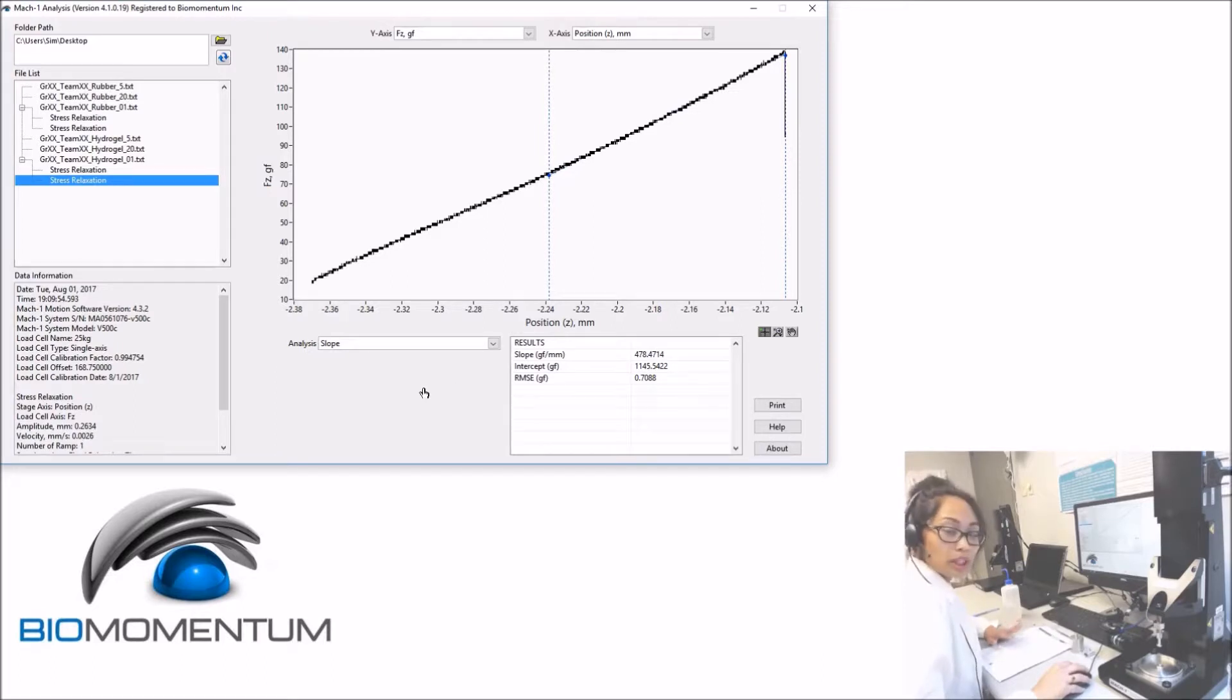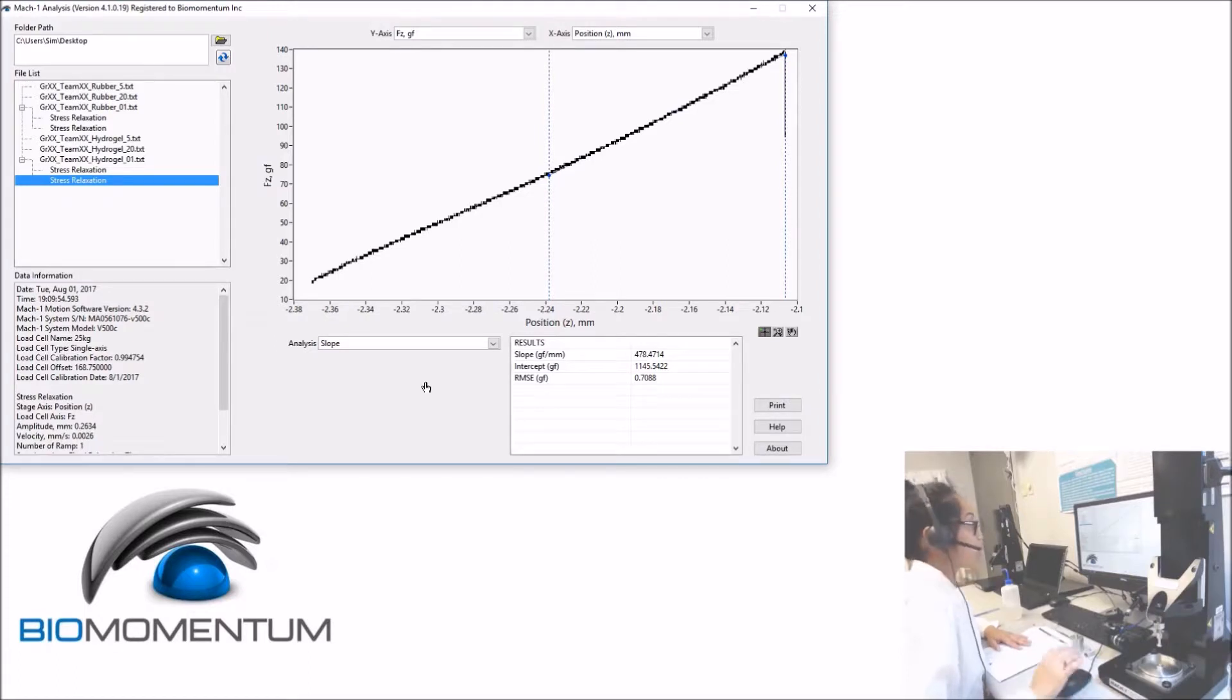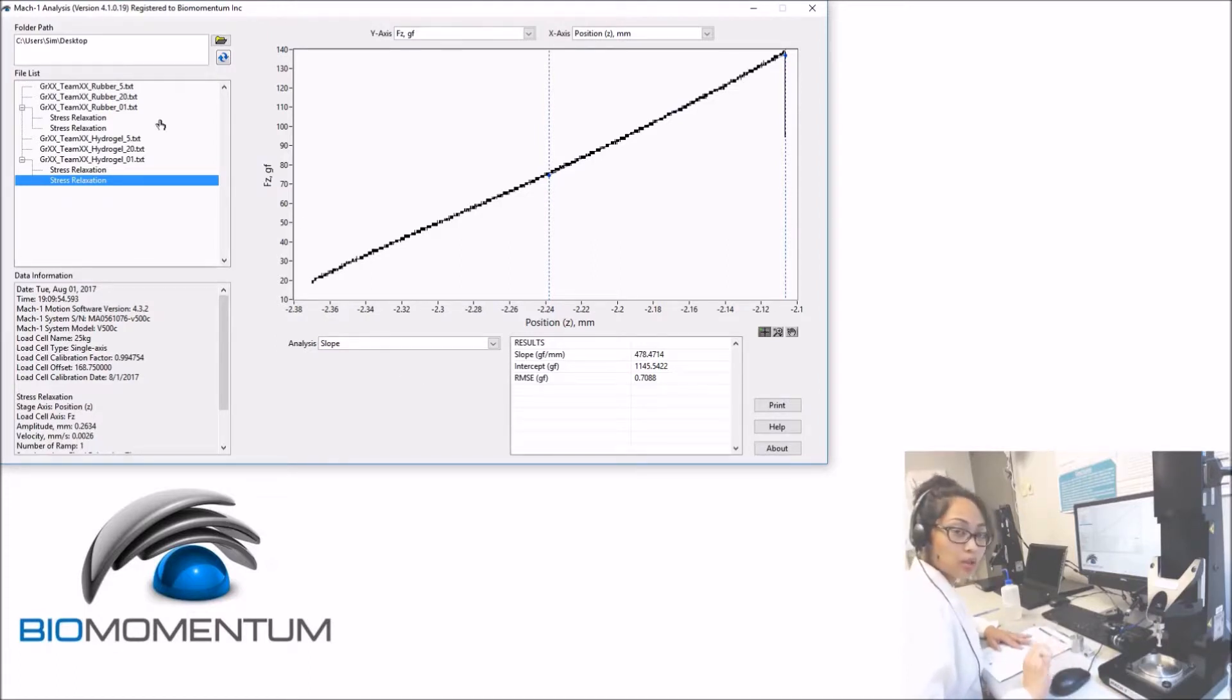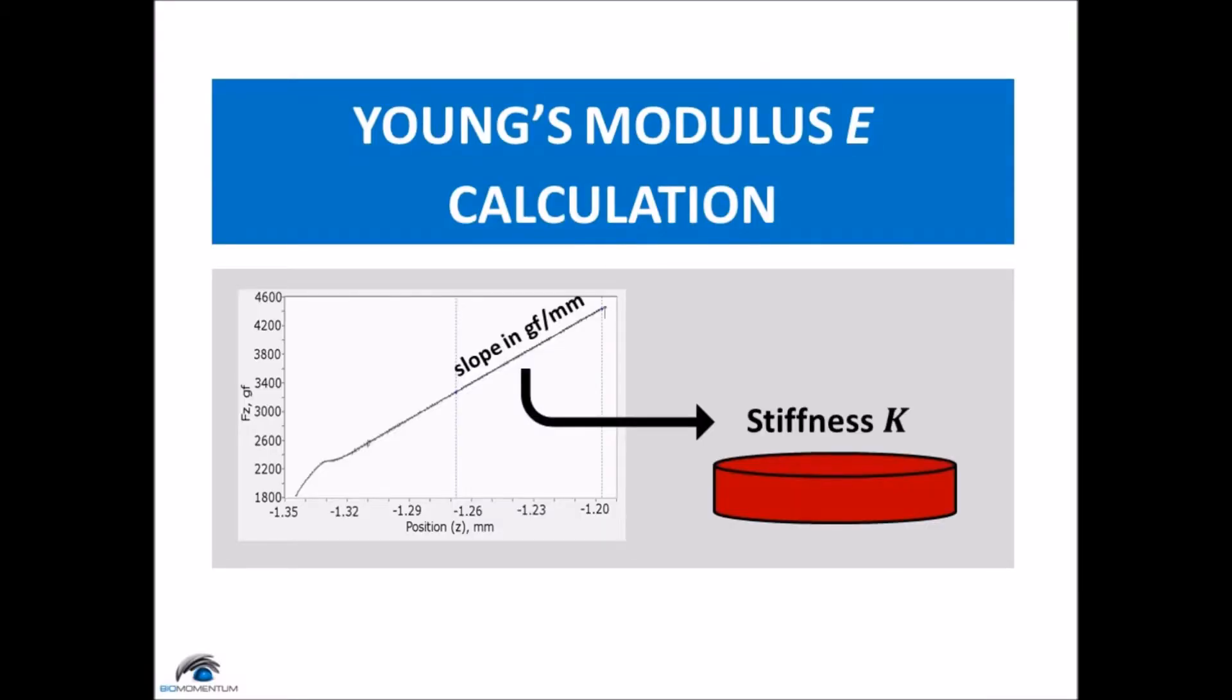Repeat those steps for the two remaining rubber disks and the two remaining hydrogel disks at different strain rates, which are 5% and 20%. The slope obtained from the analysis corresponds to the stiffness of the sample.